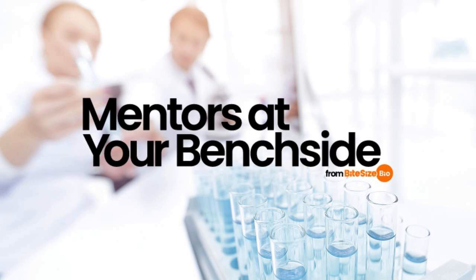Frequently asked questions. How can I avoid nuclei clumping in my extracts? First, ensure that all your cells are healthy when you begin to extract nuclei from them. You can remove large clumps by filtration or density gradient centrifugation. You can also modulate the osmotic pressure of the extraction buffer by adjusting the concentration of osmolytes such as sucrose. If your nuclei can tolerate it, balance the electrostatic interactions between nuclei by adding or adjusting the concentration of salts such as sodium and magnesium chloride.